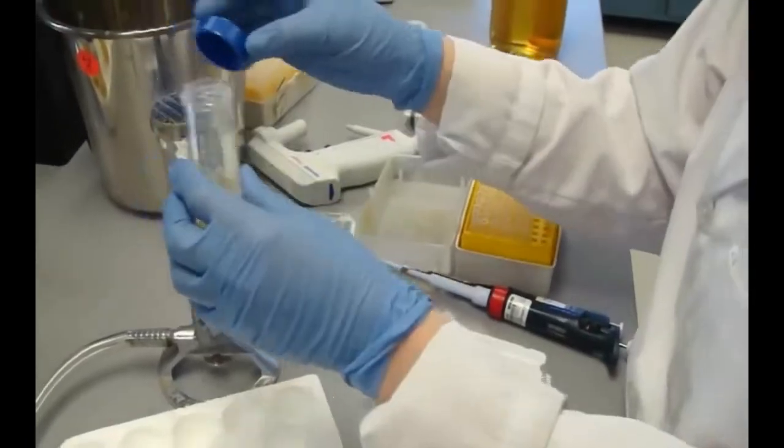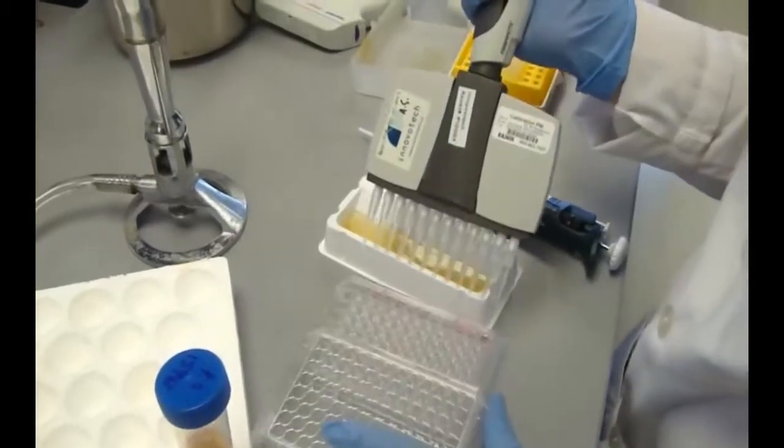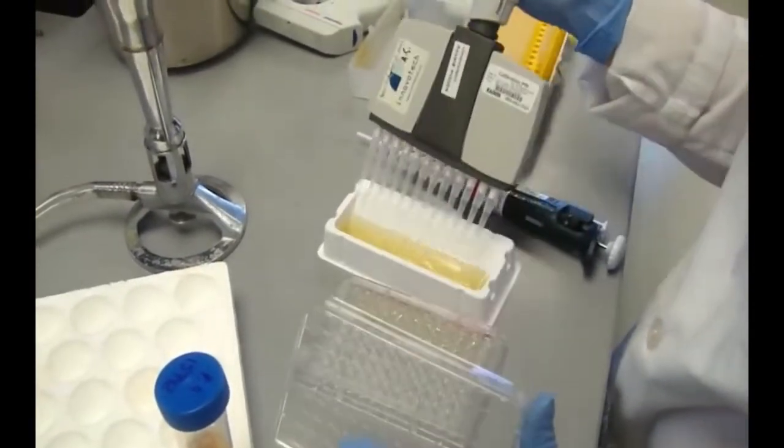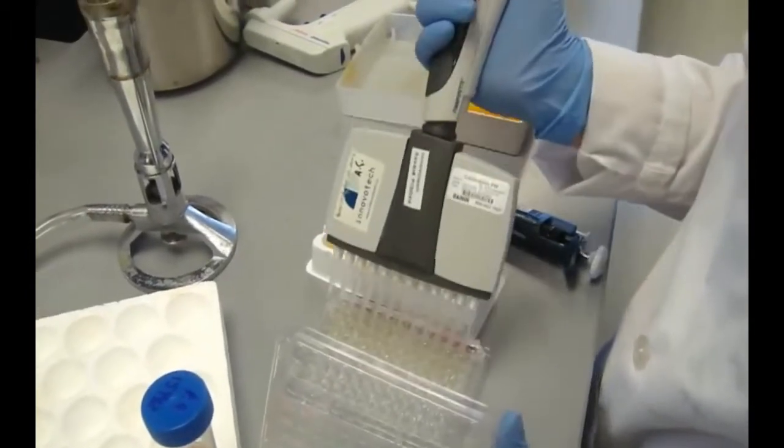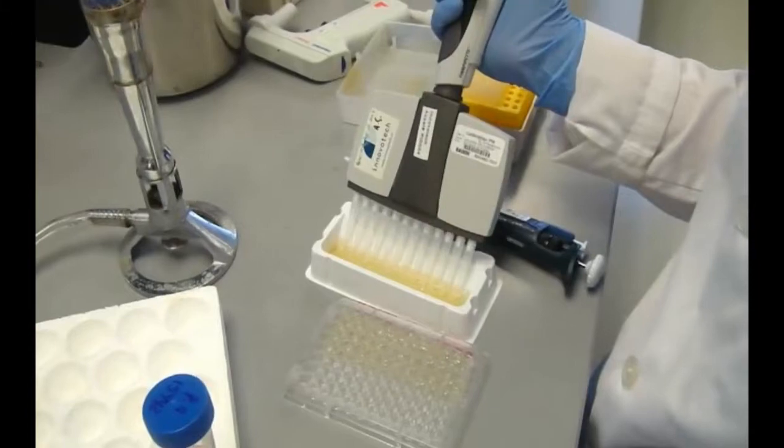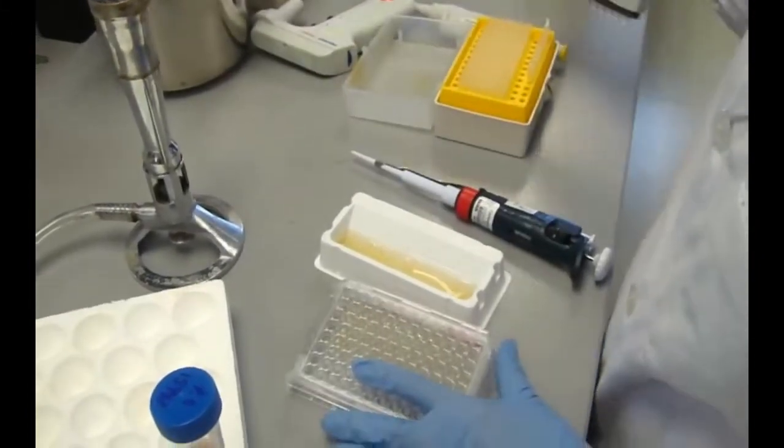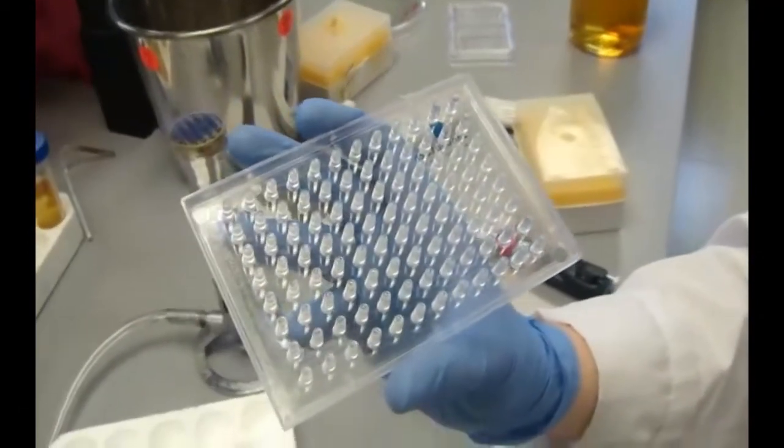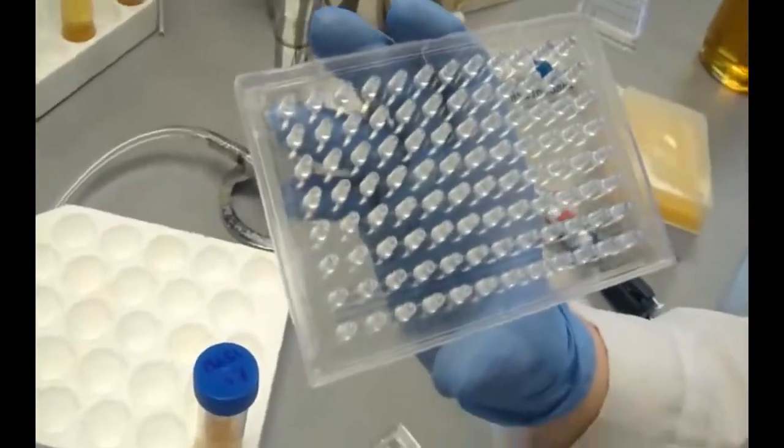150 microliters of the inoculum is added to each well of a 96-well microtiter plate excluding sterility control wells. 150 microliters of sterile media is placed into the sterility control well. A lid containing 96 pegs is placed onto the microtiter plate.